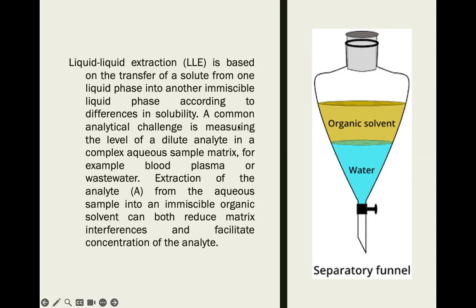So when we choose what kind of solvent to be used in solvent extraction, this is the most important part: to make sure the miscibility of those two solvents is correct. Okay, it cannot be mixed. It cannot be easily mixed. If it is mixed, then you cannot separate the solvent.